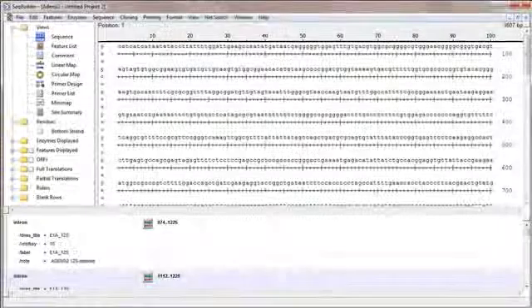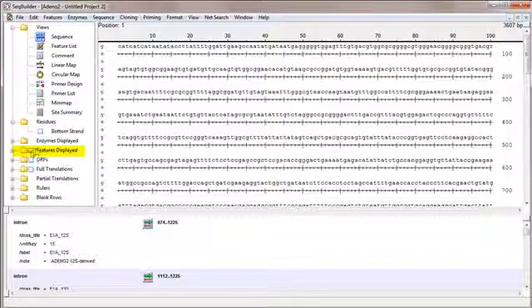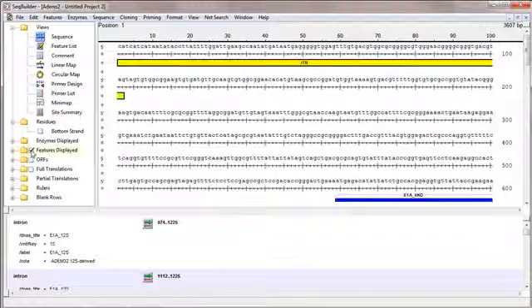To view the imported features, I can check the Features displayed box, which is in the curtain on the left side of the screen. To see the most compact display of the features, I'm going to view the sequences as a linear map.